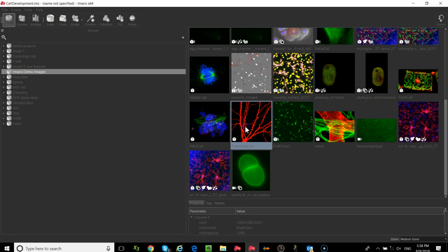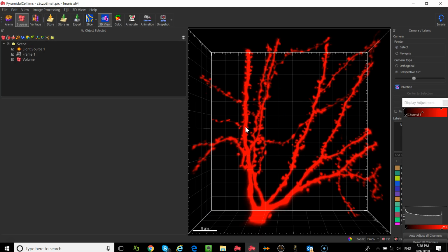So we're going to jump into some filament tracing. I'm going to focus on neuron tracing, or what we call autopath, which is the tree-like branching structures, because the algorithm is a little bit more complex. I'll focus on that one, and then depending on our time, I'll maybe jump into the skeletonized one too. Filament tracing is the last of our models. It is designed to give you length, branching information, diameter information, and depending on what you're looking at, spine information also.